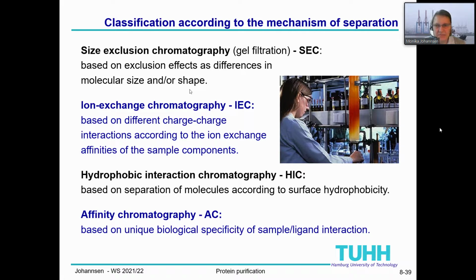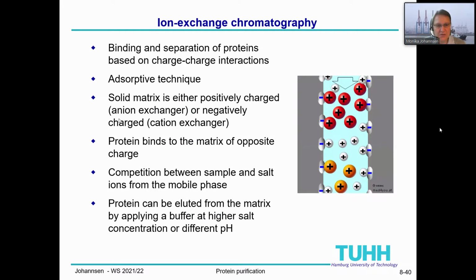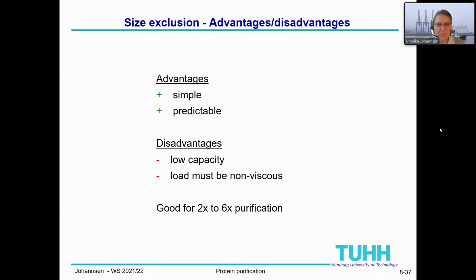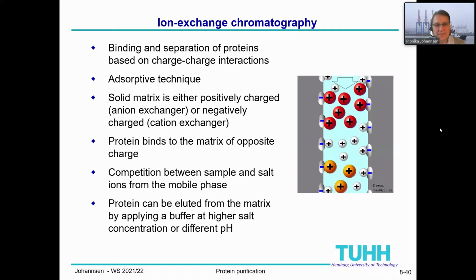Another method which is available is ion exchange chromatography. This is based on different charge-charge interactions, which are according to the ion exchange affinities of the sample components. This now is an adsorptive technique.